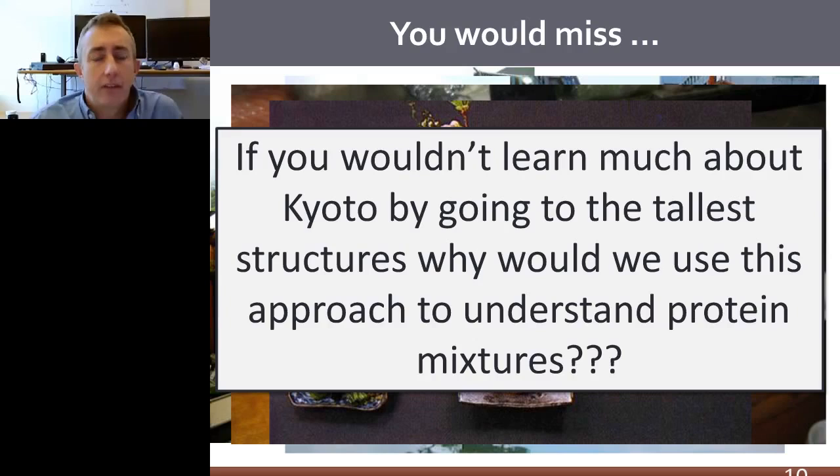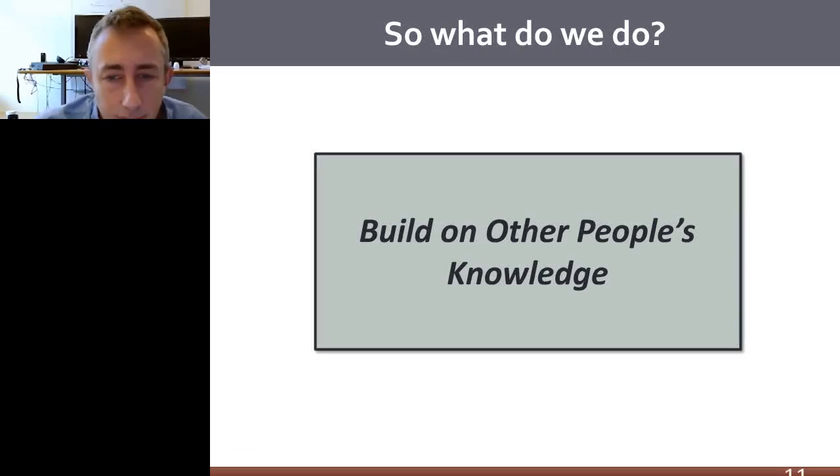Our methods have largely been based around data-dependent acquisition, where we focus on collecting data on the most intense peptide features first, and then we slowly go down to lower and lower abundance ones. Even though instruments have been getting faster and we occasionally make it down to street level, we still spend a majority of our instrument time collecting data on the most intense features.